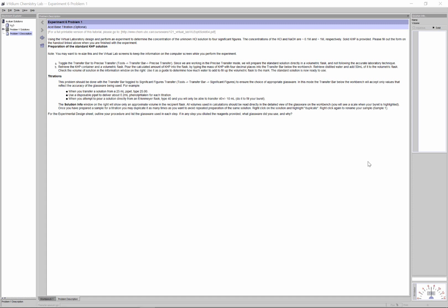If the HCl happened to be really, really concentrated, it would take a ton of volume of NaOH before that equivalence point was reached. If it was very dilute, it would just take less volume. Based on how much volume, it just ends up as a stoichiometry problem.